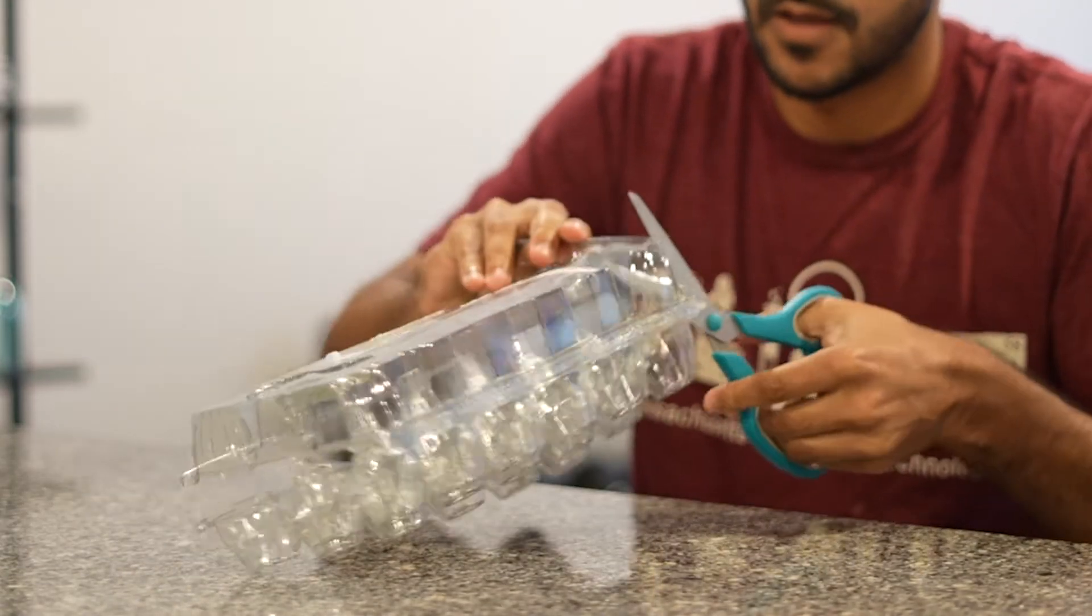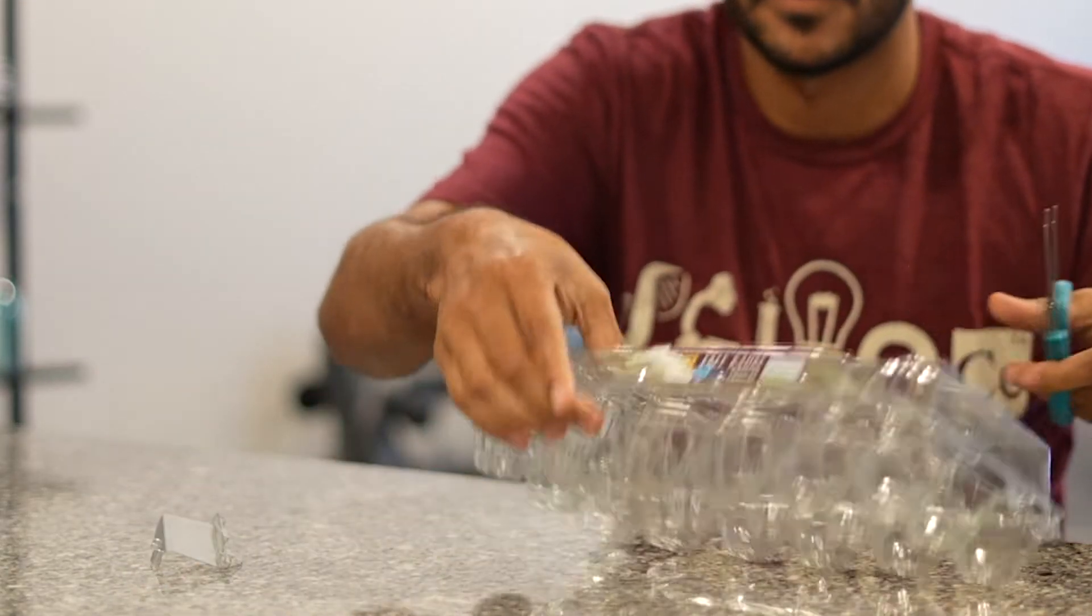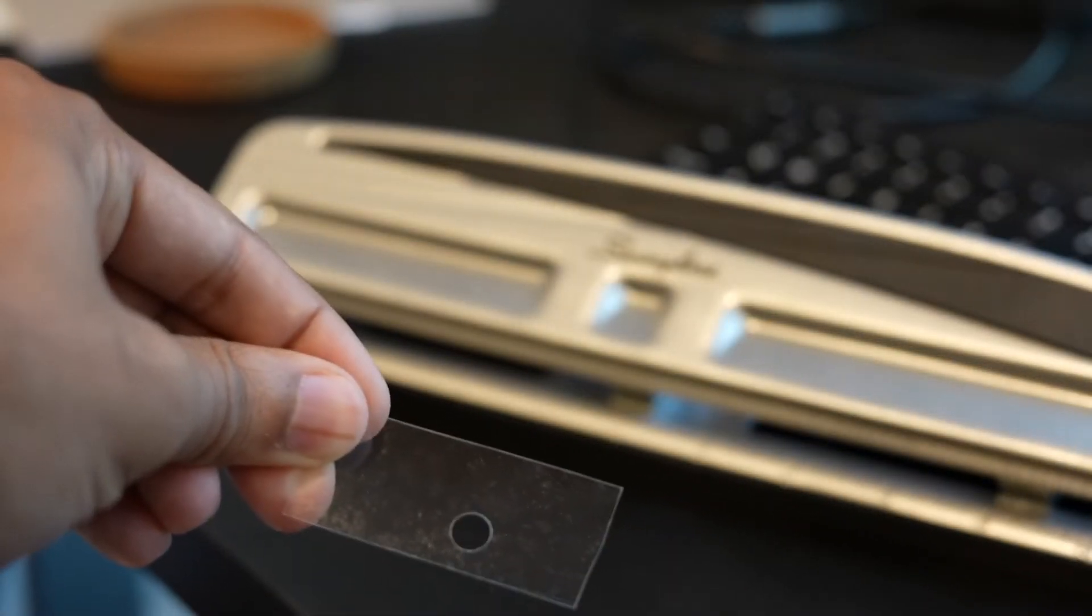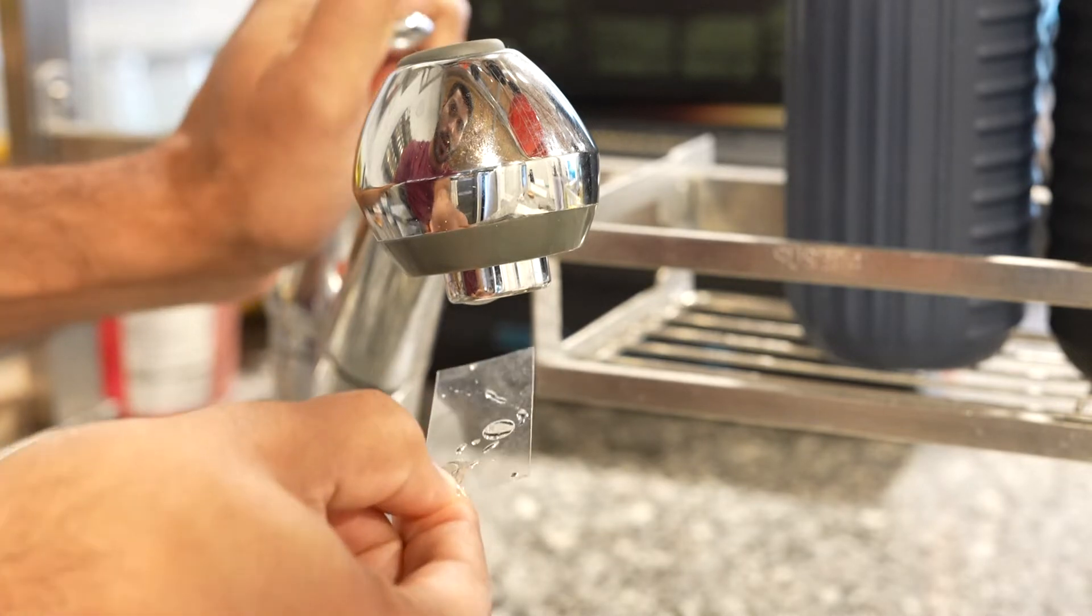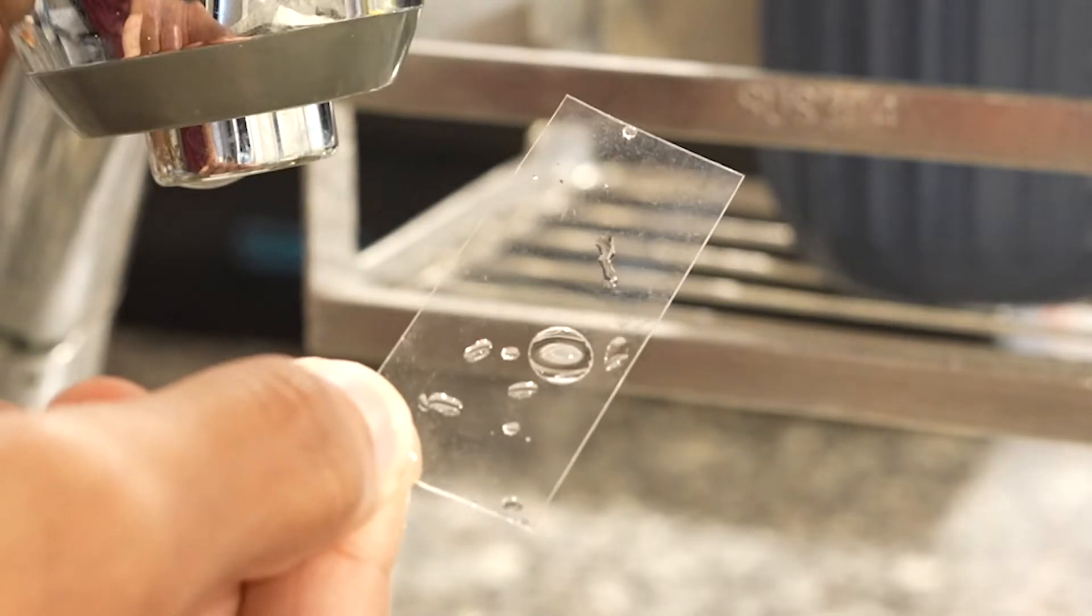You can build a microscope in two ways. The first is to punch a hole in a piece of plastic. Gently run water through it so that it forms a drop over the hole. This is your lens.